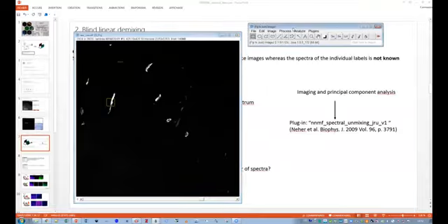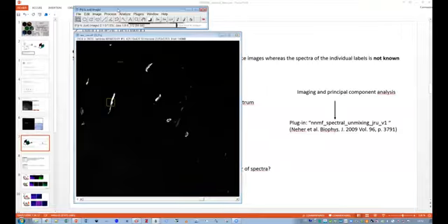And to do that, we are going to perform principal component analysis. So we are not using PCA, we are using a different algorithm, but which is close to PCA. It's non-negative matrix factorization.